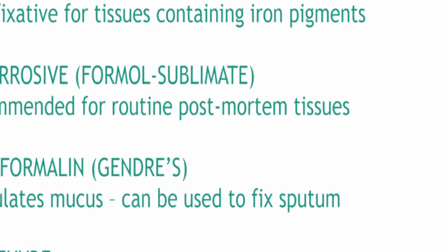Okay? Bakit sir isang bagsakan mo lang siya binigay sa amin? Babasahin mo lang siya isa-isa. Yes, class. Babasahin ko lang siya isa-isa. 10% NBF, best friend mo yan. Okay? Recommended for preservation of surgical and postmortem samples for research. Best fixatives for tissues containing iron pigments.